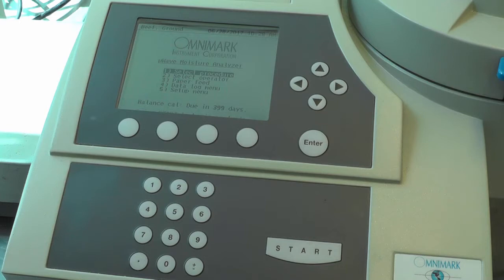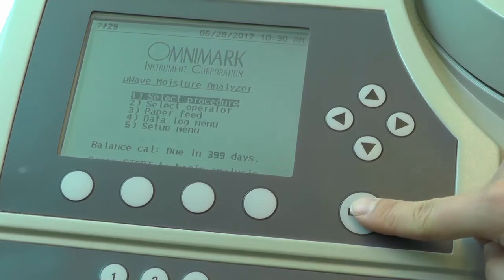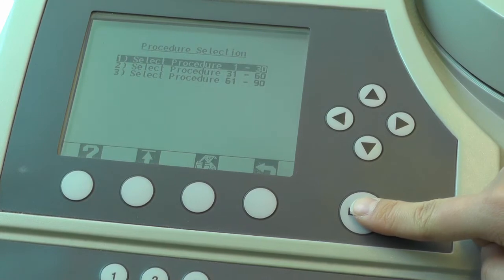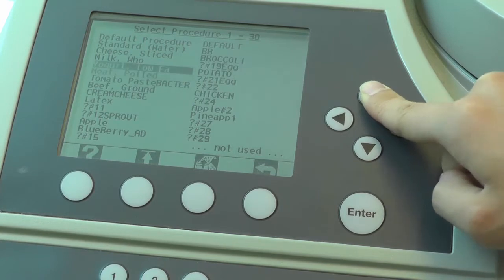Functions on the screen can be navigated using the keypads. Based on the type of sample you want to analyze, select an appropriate sample procedure prior to analysis. To select the sample procedure, first go to 'Select Procedure,' then go to 1-30 and look for an appropriate preset program before pressing enter.